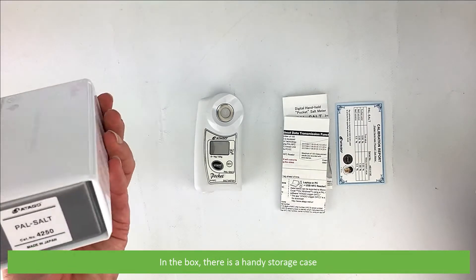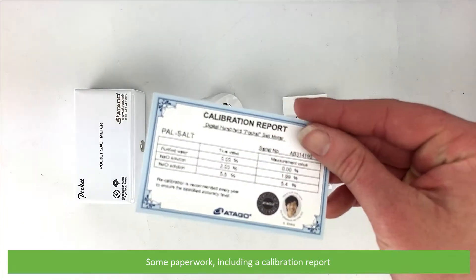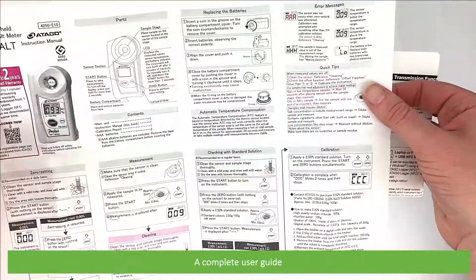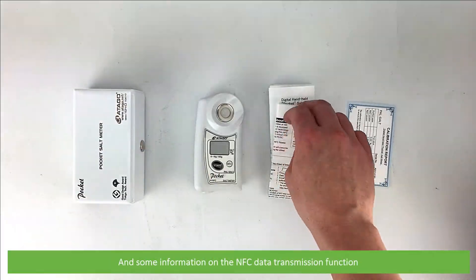In the box is a handy storage case, some paperwork including a calibration report, a complete user guide, and some information on the NFC data transmission function and the meter.